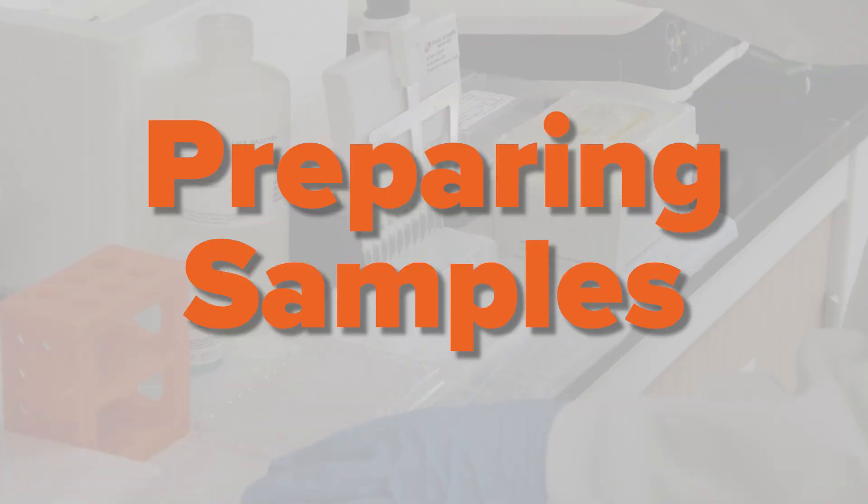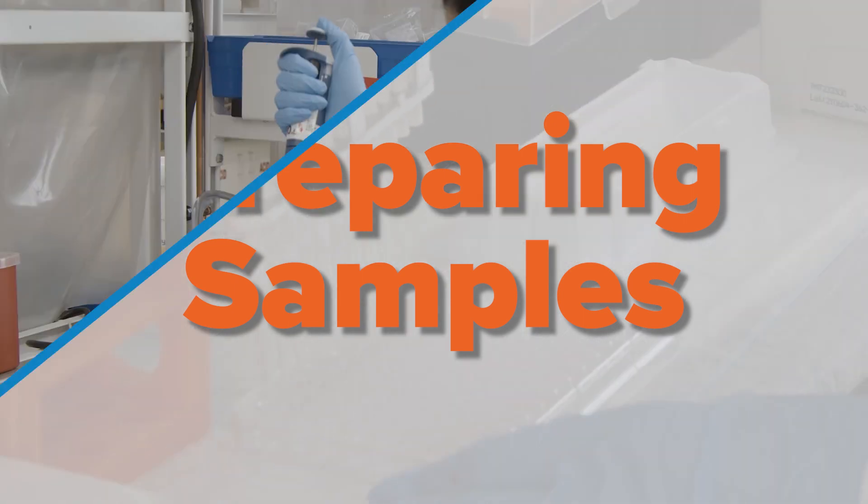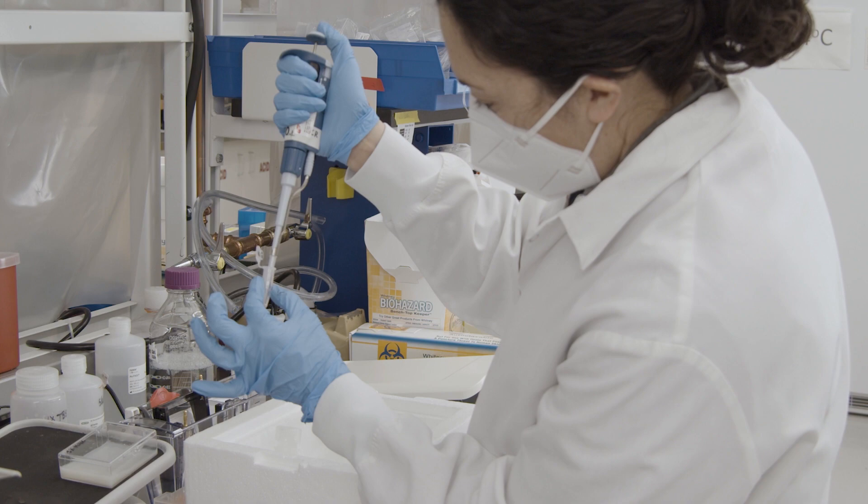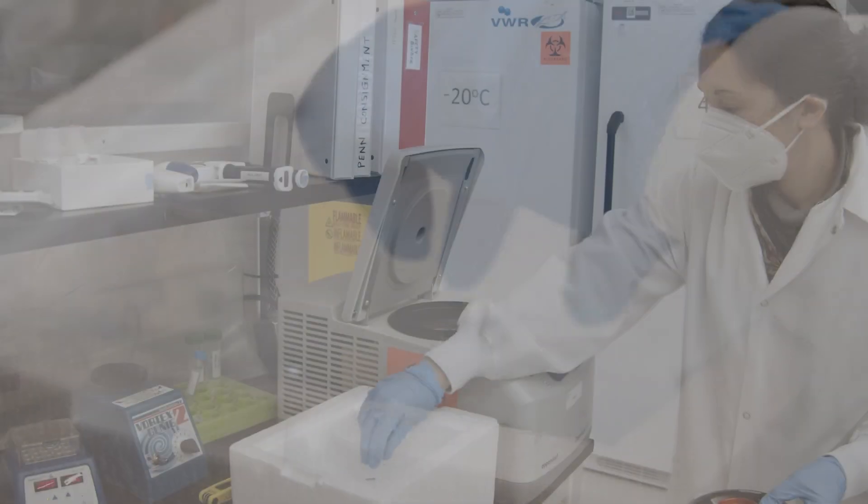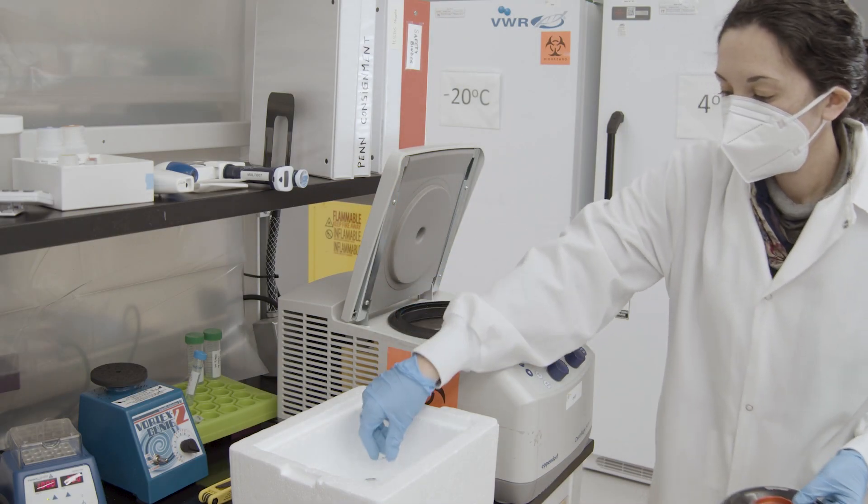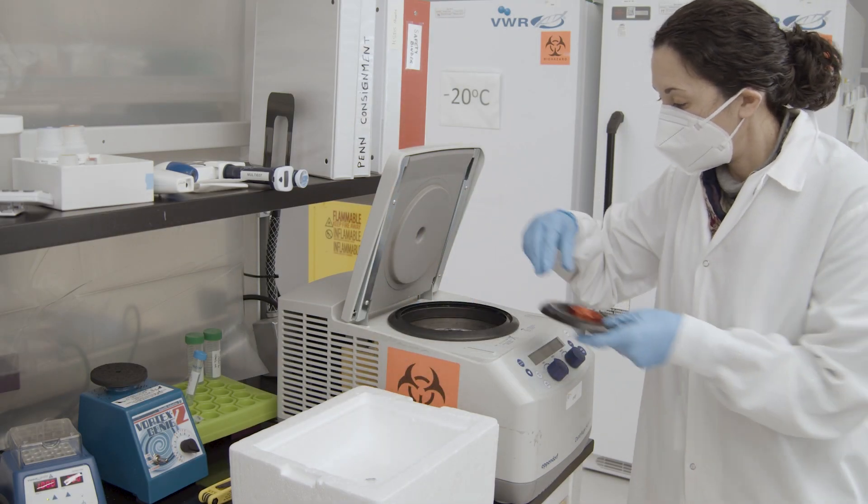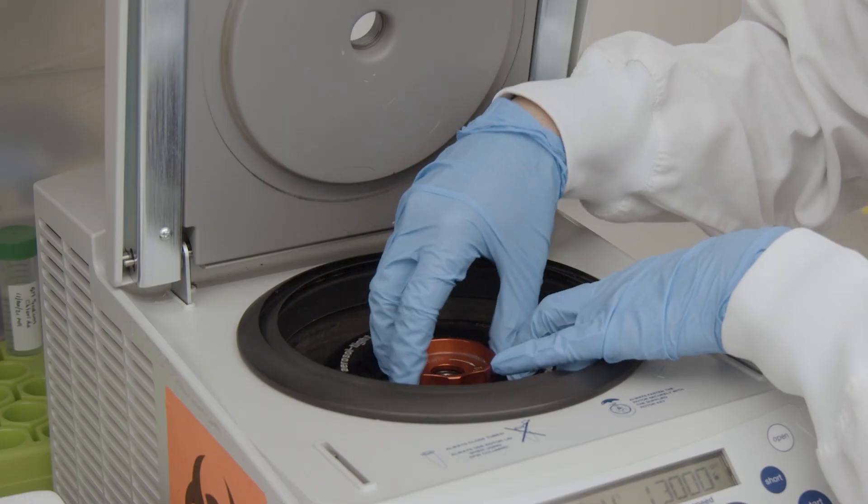We start by preparing our samples. First, we'll lyse cells or tissue samples on ice to release the proteins into solution. This can be done with a number of different reagents, so just pick the one you have on hand or the one you're most comfortable using. Once the lysis step is complete, make sure to clear the lysates by centrifugation to remove any cellular debris from the samples.